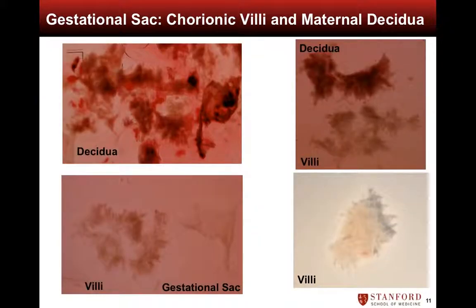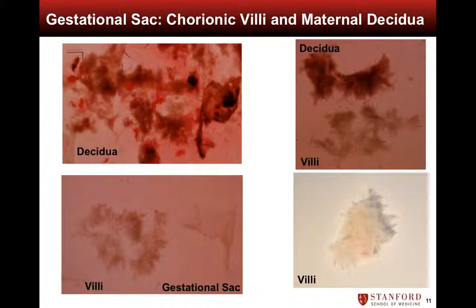Differentiating chorionic villi and maternal decidua can be challenging, so we demonstrate several examples here. The top left image is of decidua, compared to the delicate villi shown on the bottom left, adjacent to the almost transparent gestational sac. On the right we show an example of decidua adjacent to villi and below an image of villi alone. Notice the delicate, frond-like architecture that is characteristic of chorionic villi.